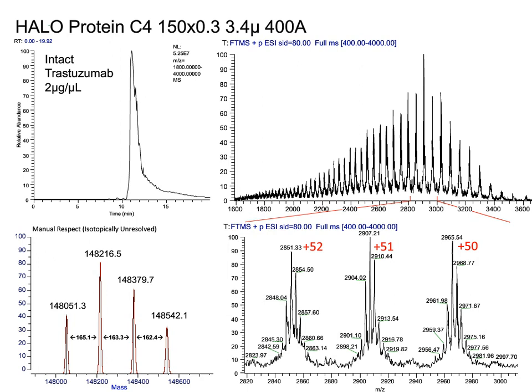I'd like to direct your attention to the blown up mass spectral data, where we see what looks like a mixture of signal and noise. And the reason why I'm drawing your attention to that is not to say that I can't collect decent quality mass spectral data, but to point out that there may be not just noise in there, but complexity that results from the complexity of the analytes that we're undertaking LCMS with.